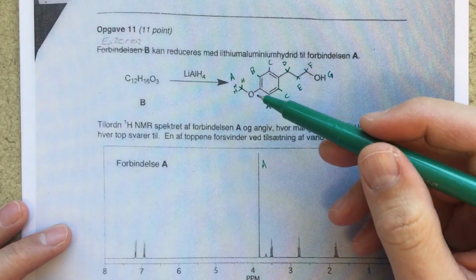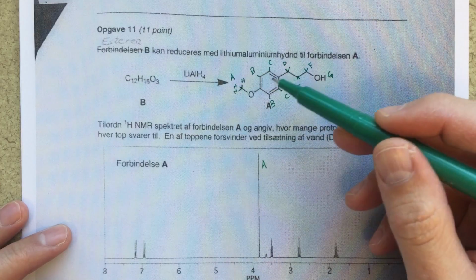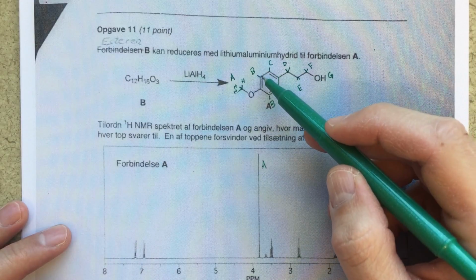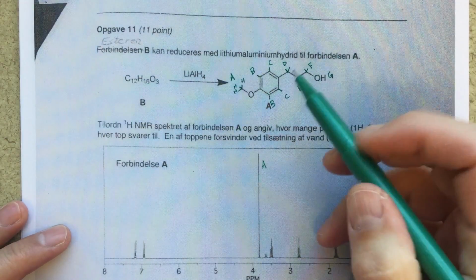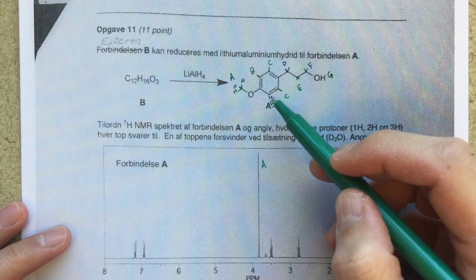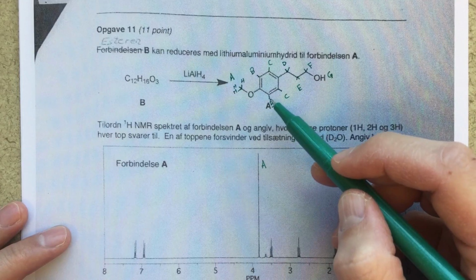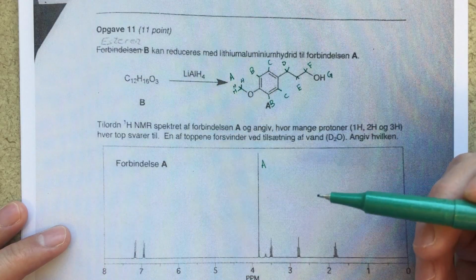The next thing, I guess we could just go down the list, B and C. For B and C, these are going to be in the aromatic region. So aromatic region's out here, so around 7. That's where we're going to find things on our benzene rings or things like that. And these should integrate to 2 each, doublets. So this B, there's 2 of them. They should be equivalent. And I say a doublet because each one of these B's is going to be split by C. So we're not looking that there's 2 C's or anything like that. We're just looking on the adjacent carbon, how many protons are there. So from the point of view of this proton B here, it's going to be split by this proton C. So I should see a 2 high, and then each one will be split. It should be a doublet.